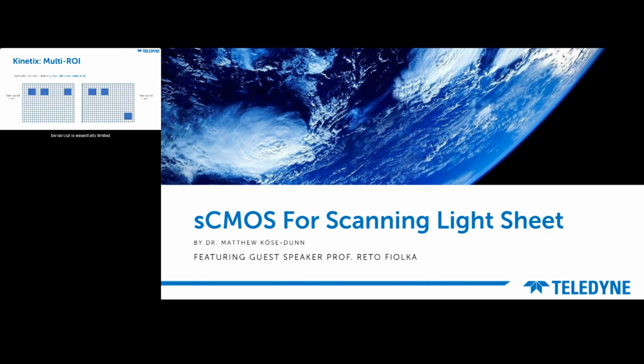Existing region of interest behavior is essentially limited by bounding box constraints. If you want to image those 3 regions on the left, you would establish a region like so, and it would be very fast imaging. However, if you have the situation on the right, where one of your regions is offset, you'd have to scan everything from top to bottom within that red box, and this would limit the speed. So the difference between a small and a large bounding box effectively controls the speed of the readout, because it has to read all the pixels in between your desired areas.